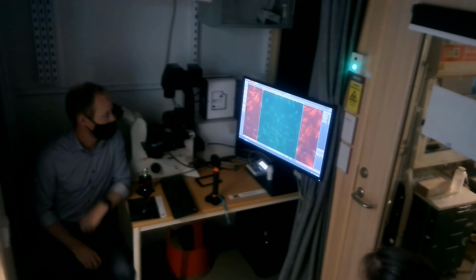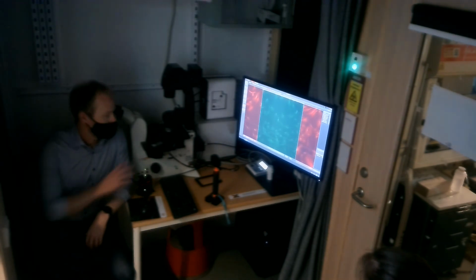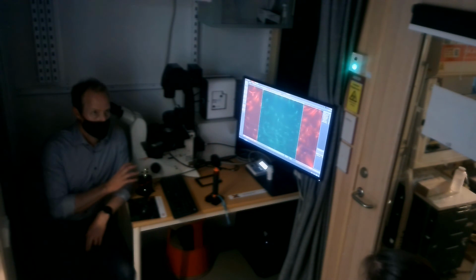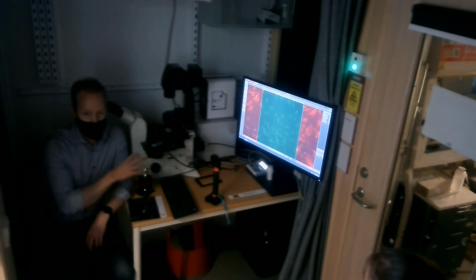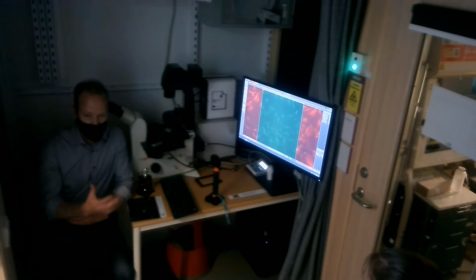So on this system there's one function that you can have on the DMI8. That's a function that makes the whole system go even faster. It was not really crucial at this point. It might be something you upgrade with in the future.